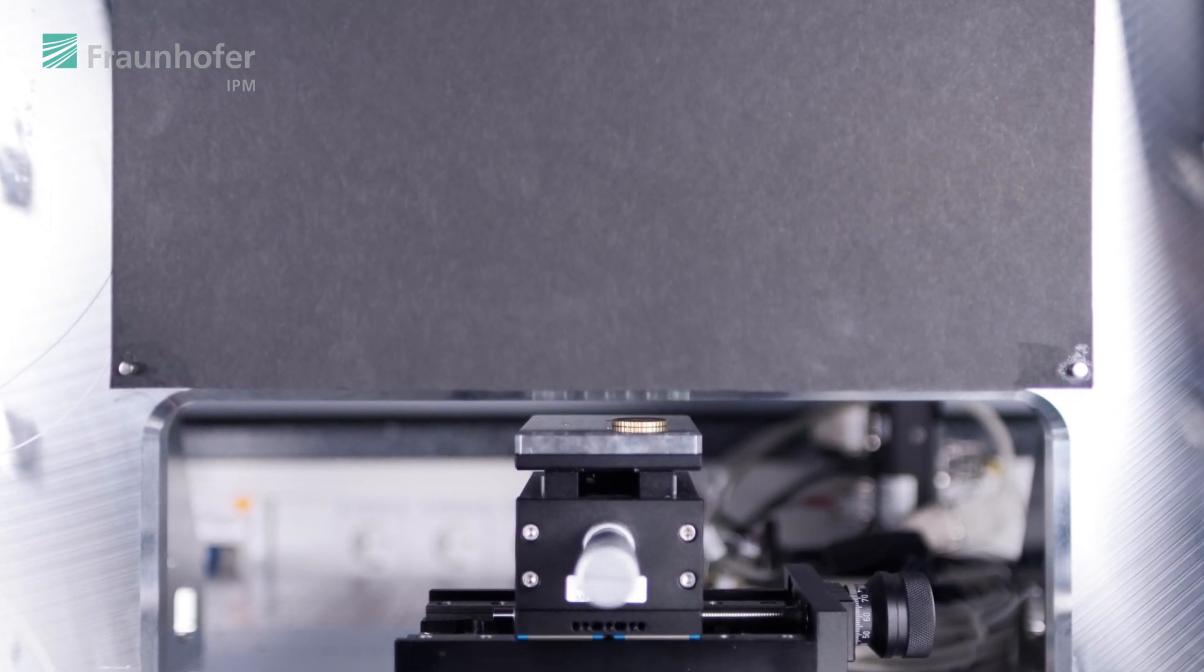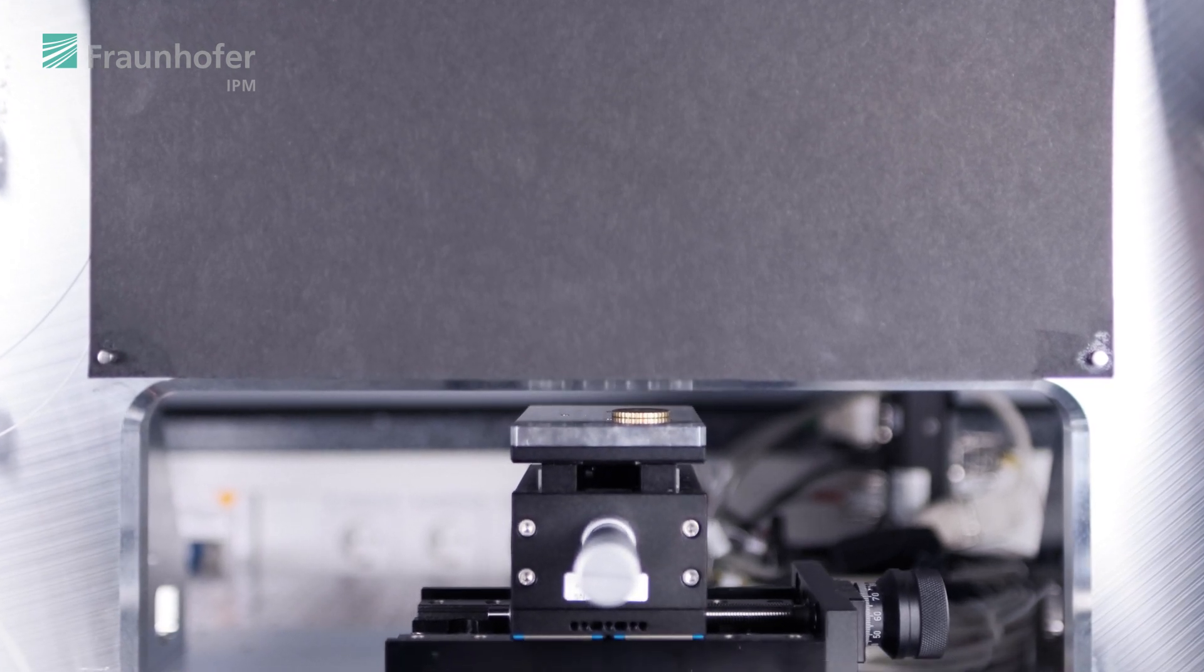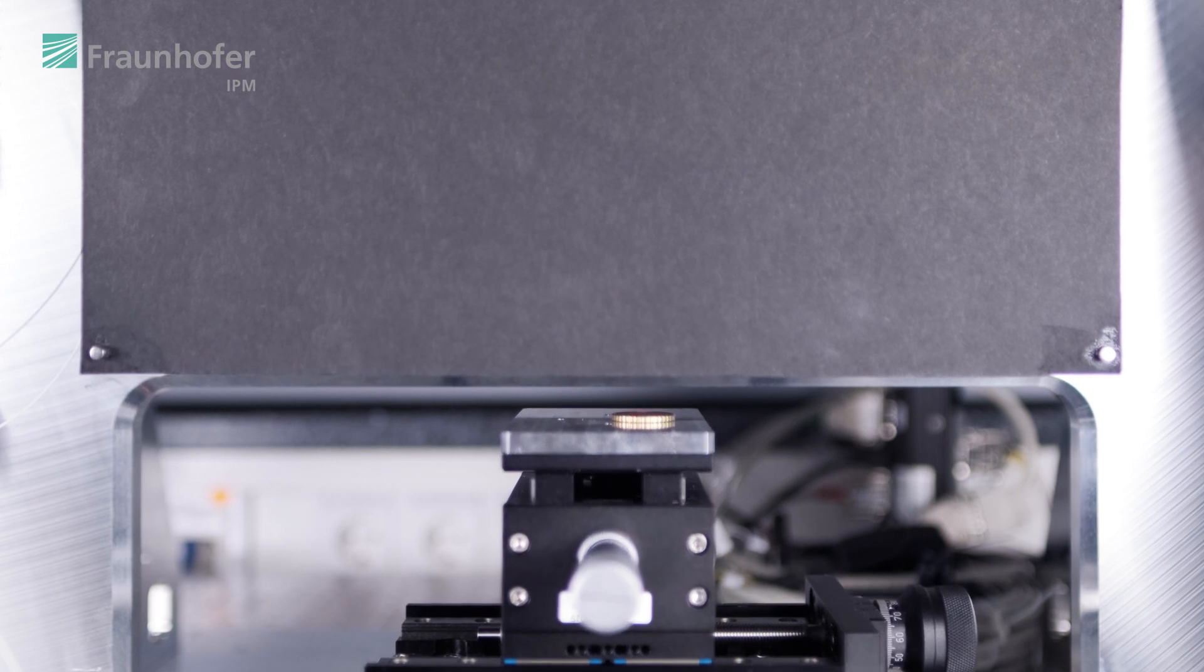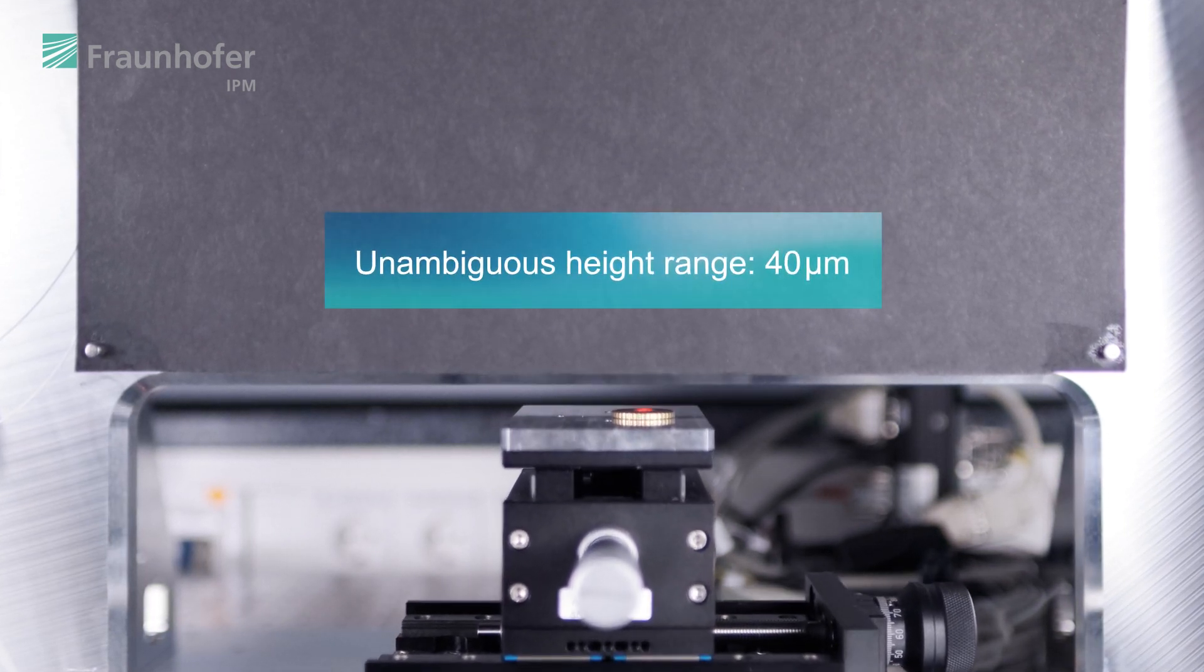We use two lasers. As you can see in the video, they emit red light. They emit slightly different wavelengths so that the difference frequency corresponds to a larger wavelength and we can measure heights unambiguously in a range of about 40 microns.